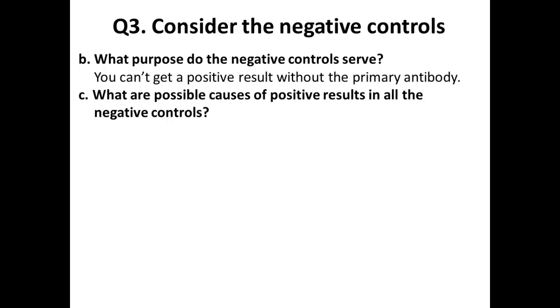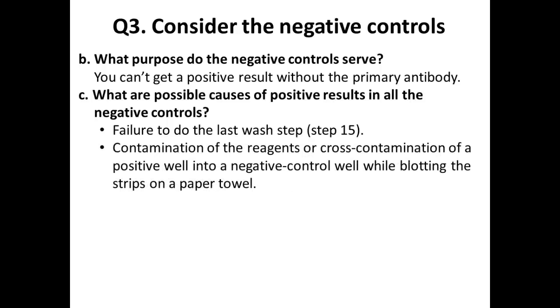How could this happen? How could you have positive results in your negative controls? Failure to wash, right? Don't wash stuff out and stuff gets left behind. Contamination of reagents, cross-contamination when doing the procedure, which I'm going to teach you guys how to do so you don't.